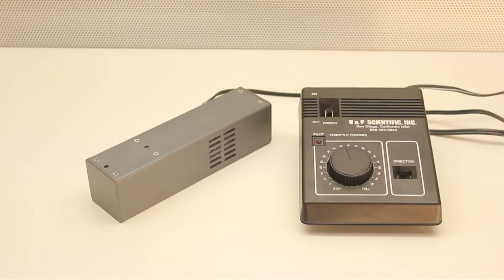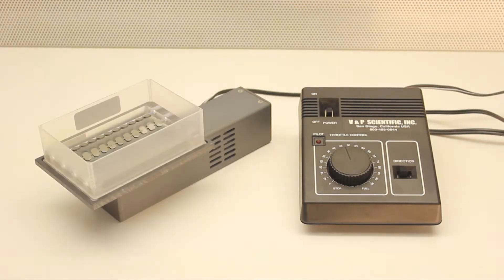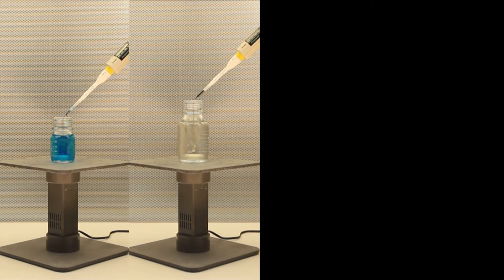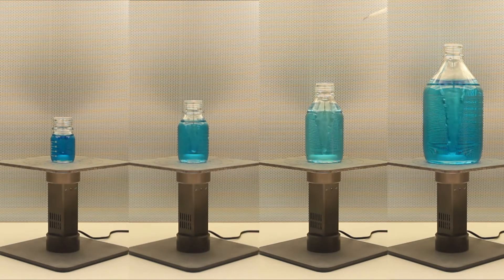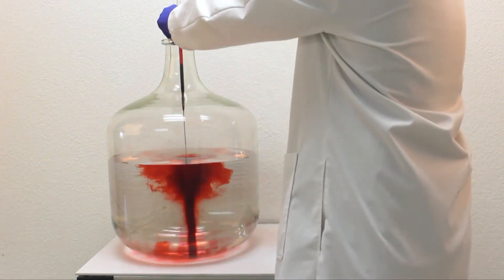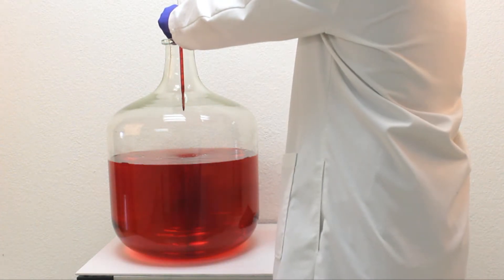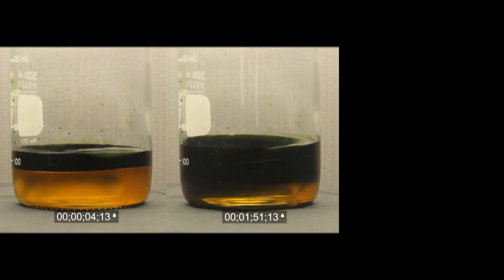VMP Scientific introduces the Multi-Stirrus, a compact, versatile stirrer with multiple configurations for different types of mixing and applications. The Multi-Stirrus can be used as a powerful conventional stirrer capable of mixing large volumes or extremely viscous solutions. Coupled with VMP's powerful stir bars, it can mix solutions as thick as honey without any problems.